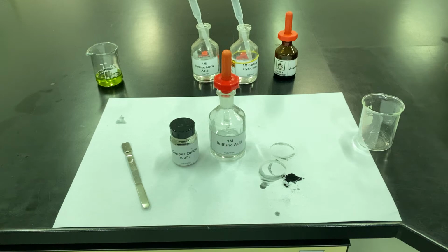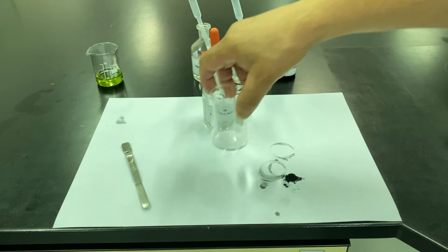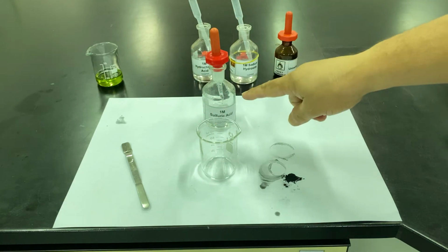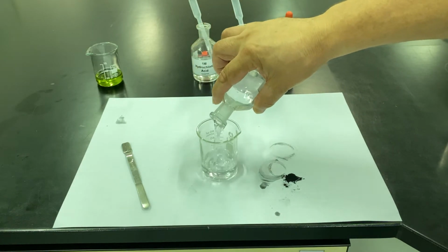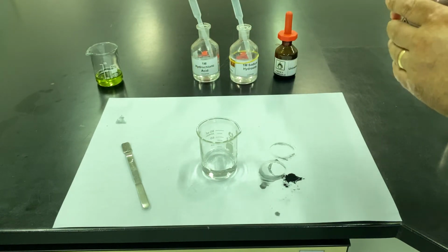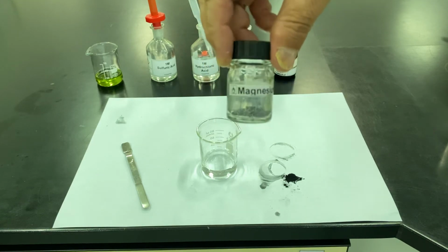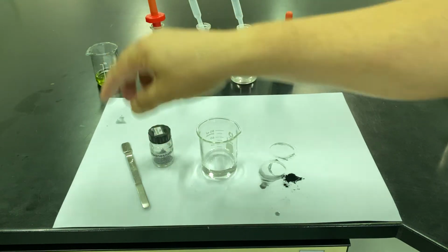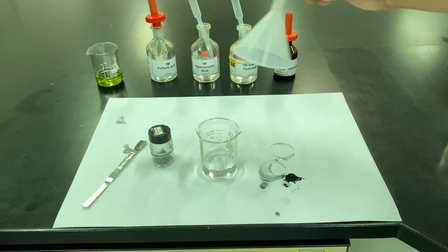Right, last one I want to show you is not a neutralization reaction. I want to show you a reaction between an acid and a metal. Okay, so I'm going to go big with the sulfuric acid again. Now, the metal I'm going to react with is magnesium. Okay, so the magnesium is going to go in here. Right, now one thing, I want to collect the gas that's being produced here.